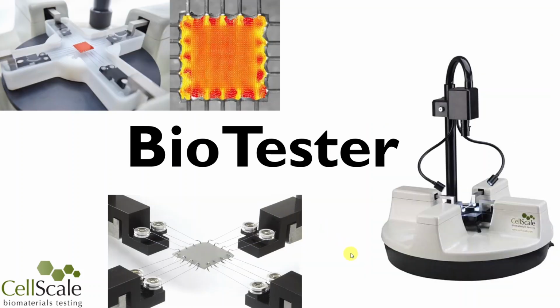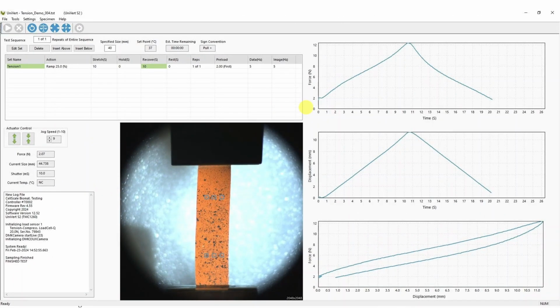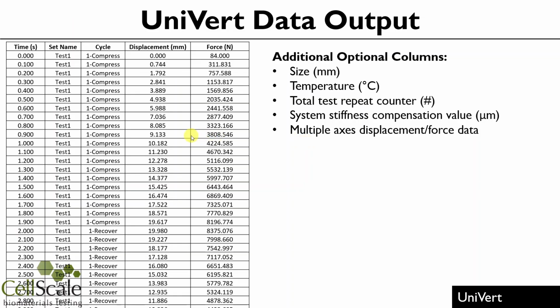The biotester series are used for testing materials in biaxial tension. This is necessary to understand the mechanics of materials that have directionally dependent properties, such as heart valves, blood vessels, and other biomaterials. The software for these systems is used to create test protocols, execute and monitor tests, collect data, and analyze the results. The numerical data is written to a text file and contains time, cycle, force, displacement, and temperature information. The question is, how can we use this output to describe our materials and calculate material properties? This is the purpose of the test analysis module.